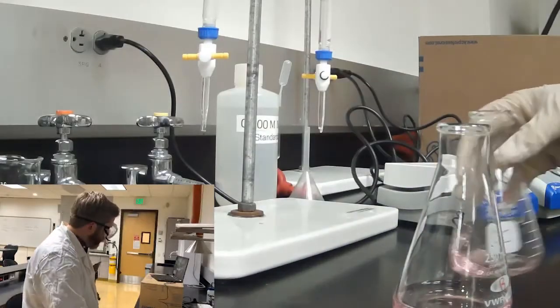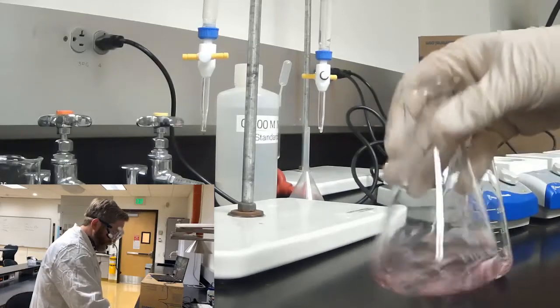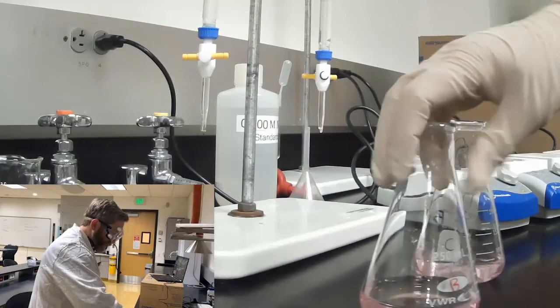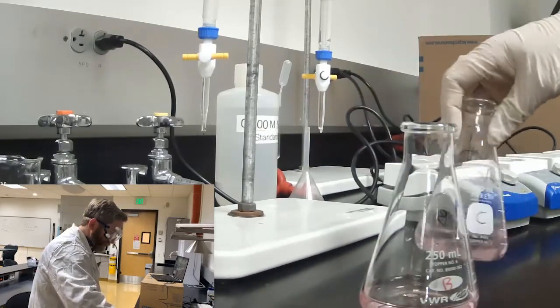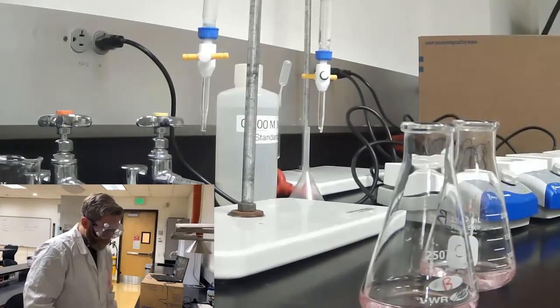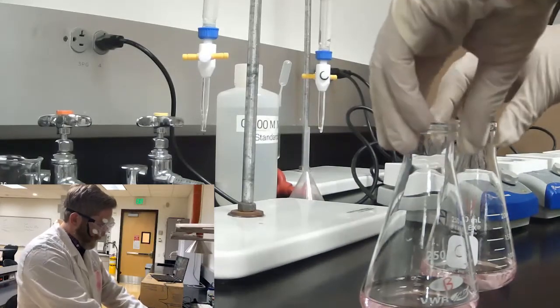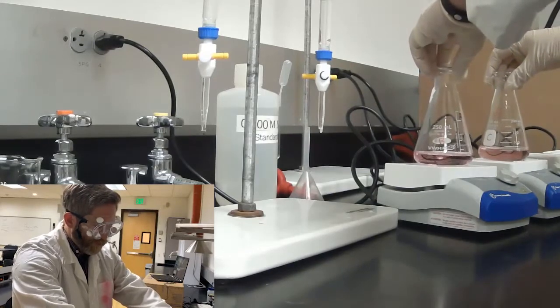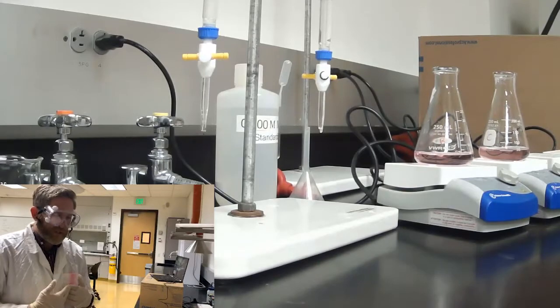Alright, so we've dissolved our sodium bicarbonate into our simulated stomach acid here. And we want to make sure that it has not changed to a yellow color. If it's changed to a yellow color, then all the acid has been neutralized. And as you can see from both of these, they seem to be retaining their color as presently constituted. So this is a multi-part reaction, so the next thing we have to do is put these on the hot plate to drive any carbon dioxide off. That will allow the reaction to continue to proceed.